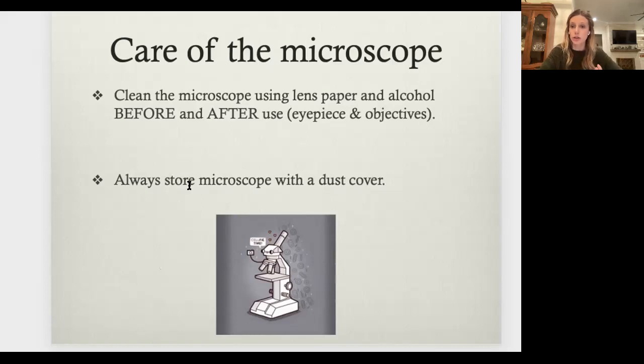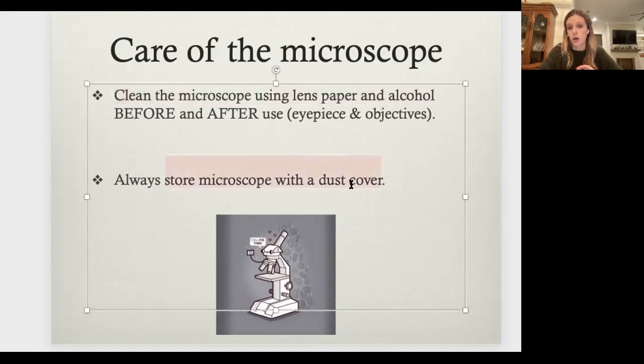We're always going to store the microscope with a cover just so dust and other particles don't get into it. So all you have to write down for this is care of microscope: clean microscope using lens paper and alcohol, store, I would just say store with a dust cover.